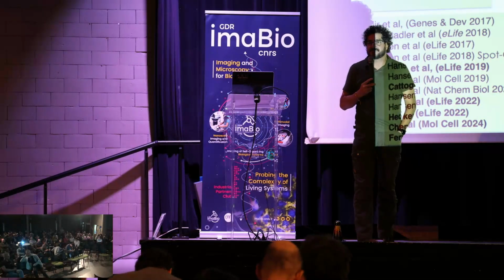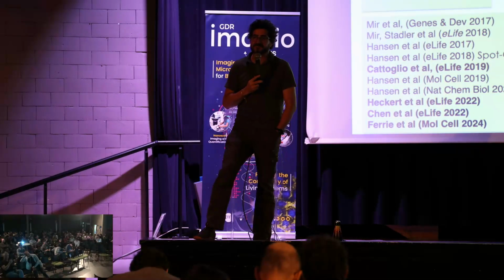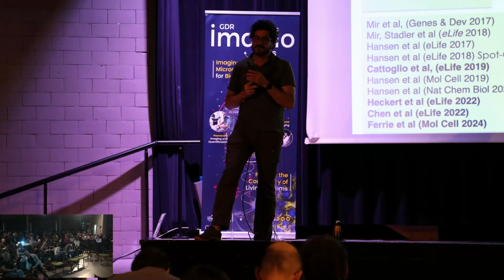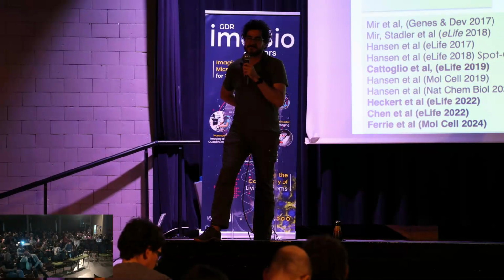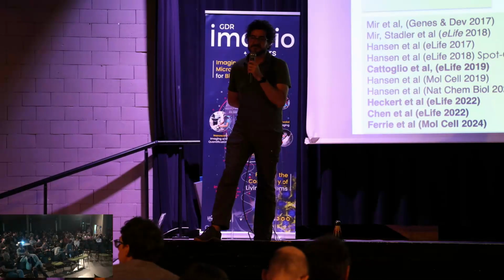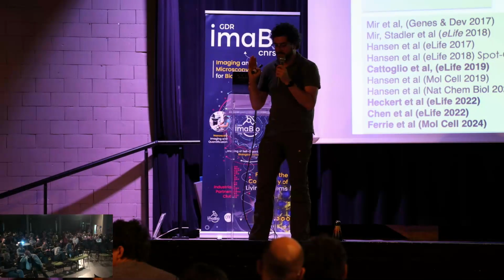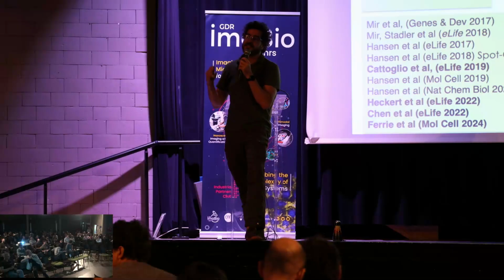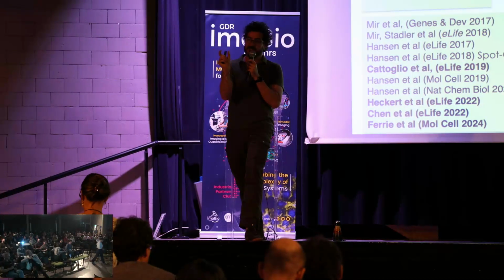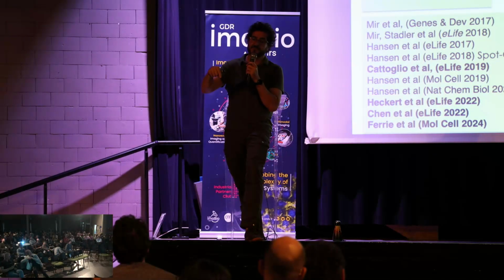No. It has nothing to do with it, because in FRET, when you have the spectra emission of the donor overlapping the spectra excitation of the acceptor, it means that there is a FRET. So it is not a transfer of energy, and the beauty of this system, why is it so helpful for us? It's because we are measuring the proximity of two dyes at the moment of photoconversion, right? So it's photoactivation as a function of the proximity of another dye.